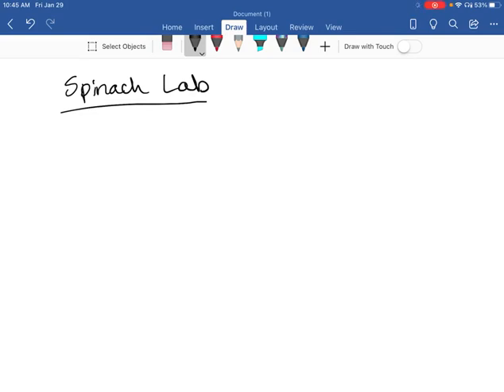Hi everyone! In this video, I just wanted to go over some review material for the Spinach lab. So in this lab, the goal is to extract pigments from spinach and then analyze those pigments using thin layer chromatography and UV-Vis spectroscopy.